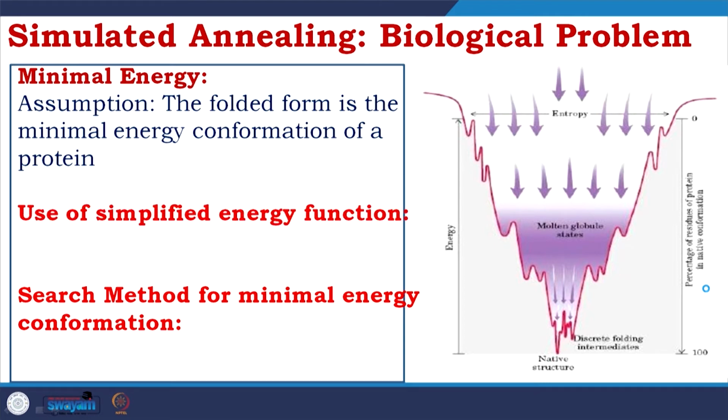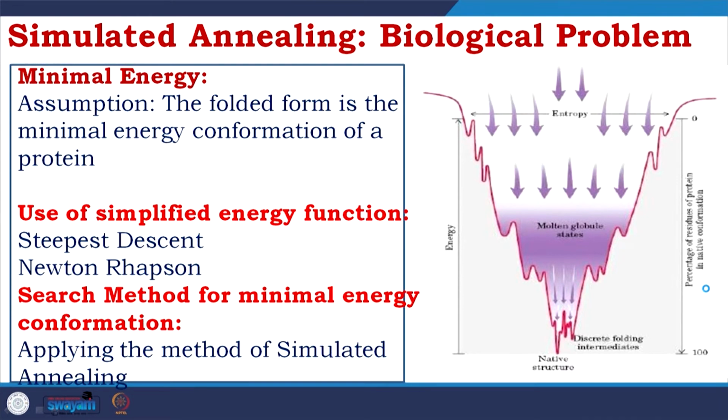We use a simplified energy function and a search method for the minimal energy conformation. The simplified energy functions, which are easy and less computer intensive, are steepest descent and Newton-Raphson, and the search method for the minimal energy conformation is the method of simulated annealing.